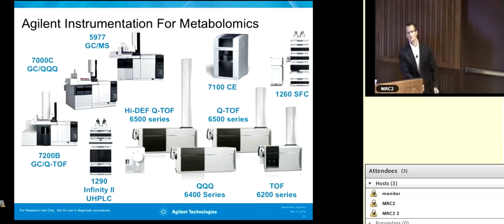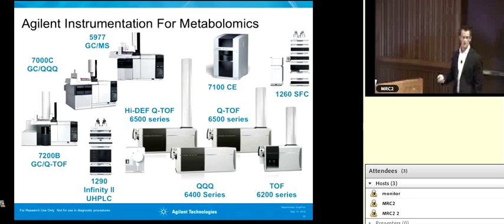There are several ways that we can summarize this data on the pathway. Some are quick, and these are very visual, very immediate. They give you some basic information about what's happening on your pathway without having to do a lot of digging. The first one on the left here is just abundance. It's very good practice to know, in any set of experimental conditions, what your metabolite pool is doing. Is it going up? Is it going down? This is strictly abundance.